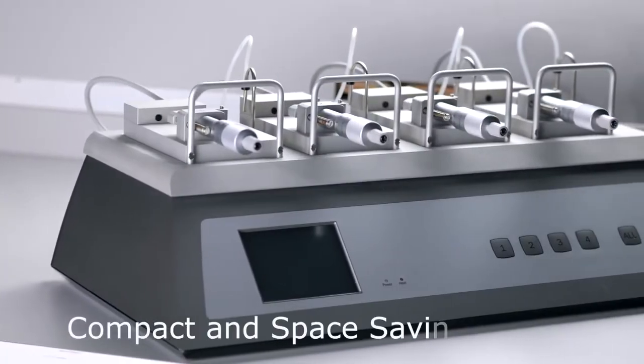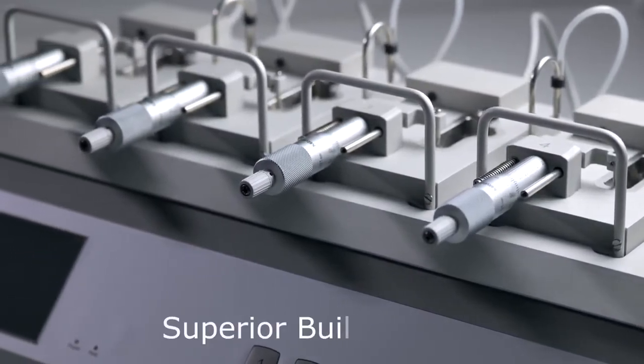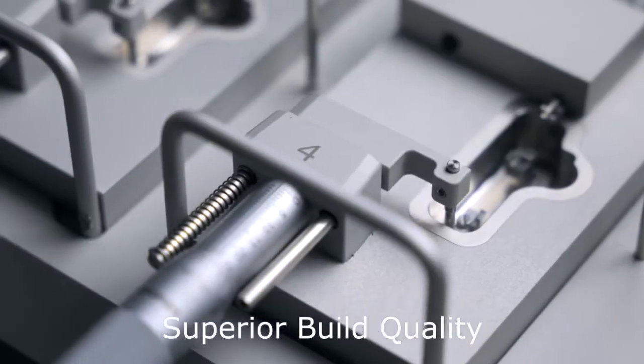The small footprint is significantly less than your traditional organ bath, and the durability stands up to daily use and provides consistent results between experiments.